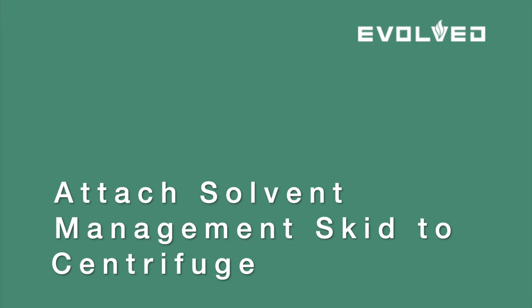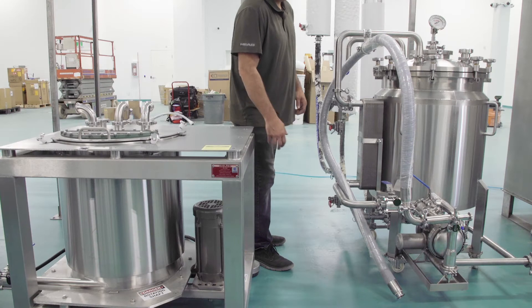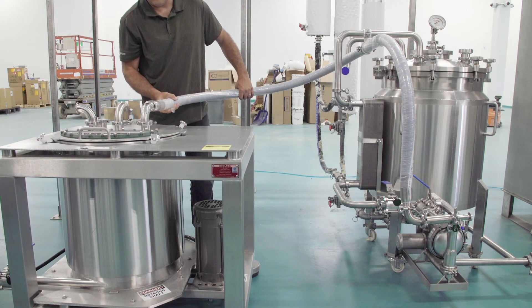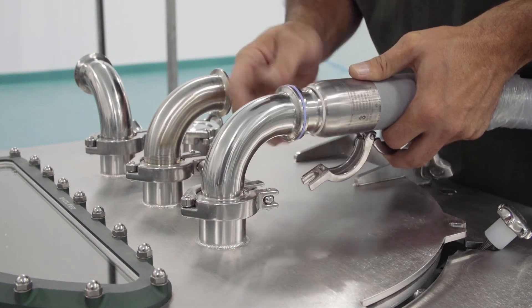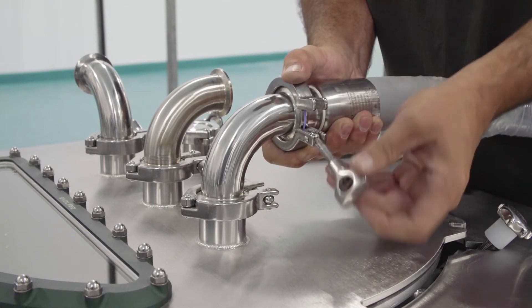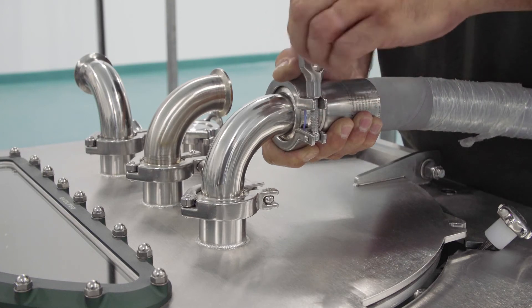Now let's get started. Attach the discharge hose from the solvent management tank to the centrifuge in the same positioning as shown in this video by the technician. Please note the orientation of the solvent management skid and the centrifuge. Ensure you have your one and a half inch tri-clamp and gasket present, and adjoin the discharge hose to the centrifuge elbow as shown, noting the orientation of the tri-clamp positioning to facilitate tightening later.